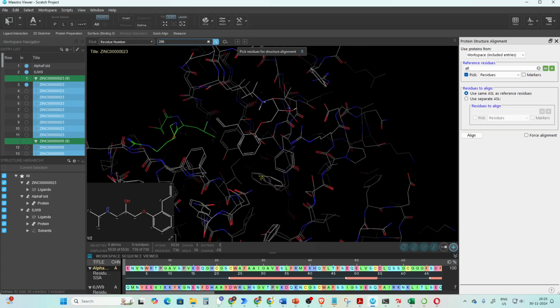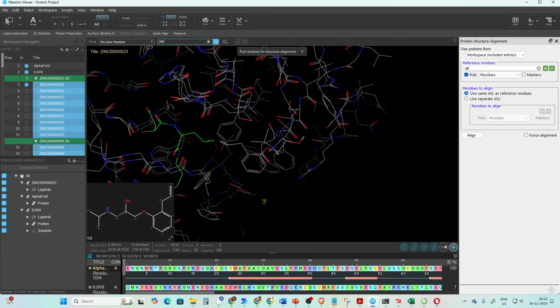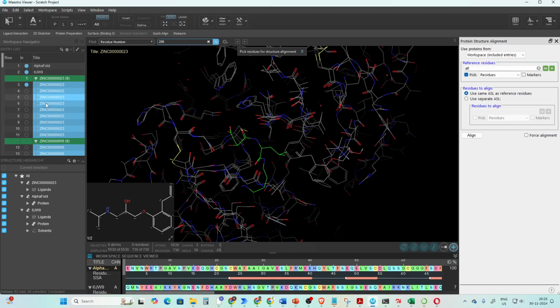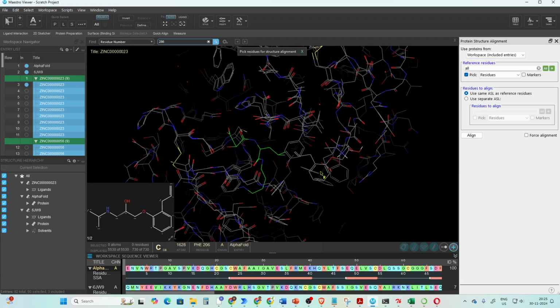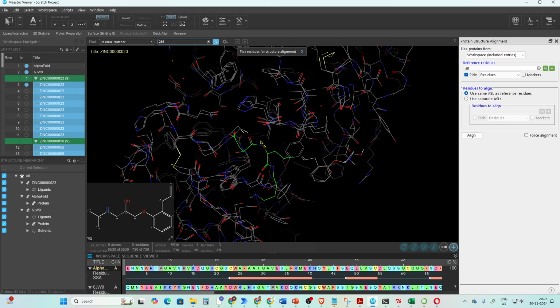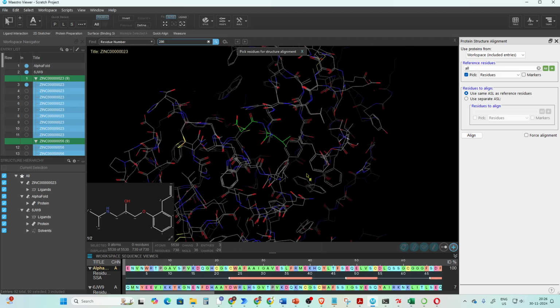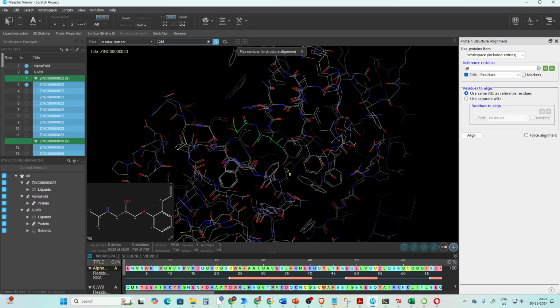Anyway, for us it's showing the active site pocket, so now we have done just 12 or so molecules, but if you ask me, I will be interested in the molecule which comes near to this particular active residue, cysteine residue. So this particular molecule that we have docked is far away, but still it is a pocket. Pocket is huge, so it's still a pocket.